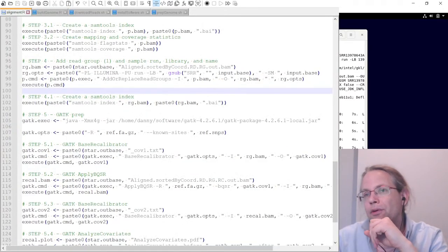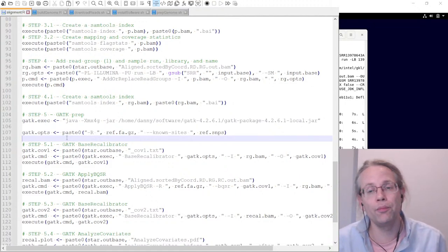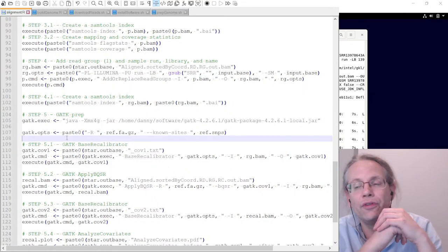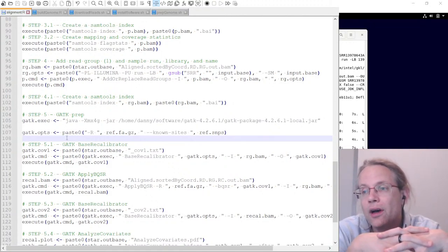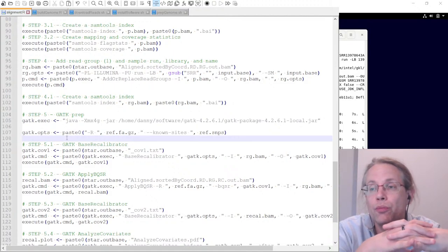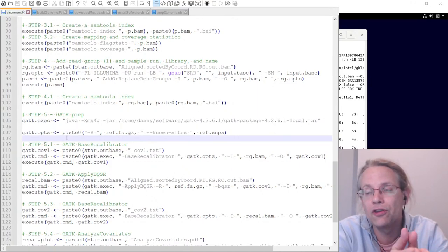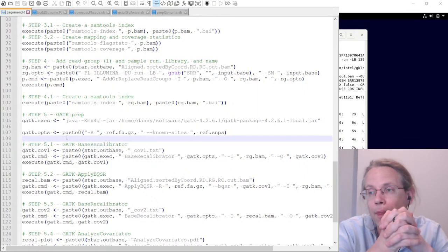All right, last step, GATK, right? Because the GATK allows us to update quality scores based on known SNPs, right? So that's why we downloaded the VCF file. The VCF file contains known SNPs in yeast. So these known SNPs should not be counted in the BAM file as being mismatches. They should be counted as perfect matches, right? Because we know that there's a SNP in other yeast species. So when we find this SNP in our animal, we don't want it to be a mismatch to the genome. We want it to be a perfect match because of the fact that we know it's there.